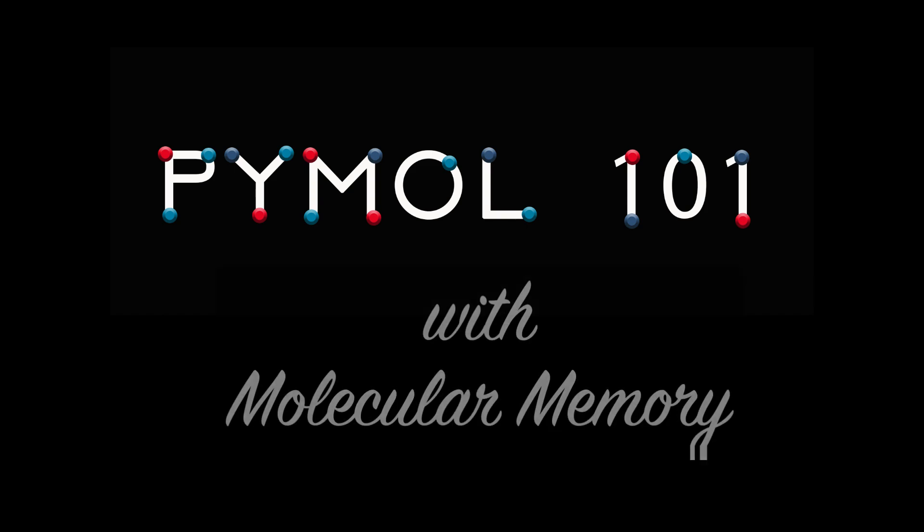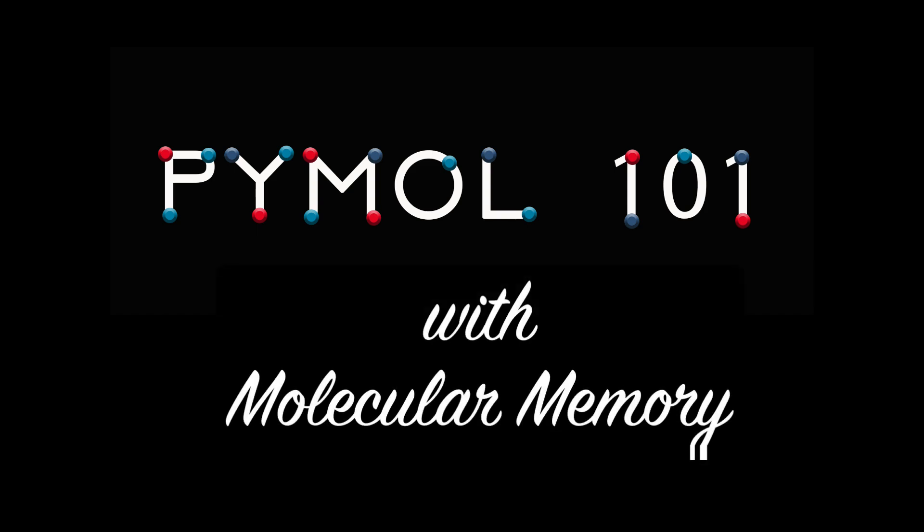Welcome to PyMol 101 with Molecular Memory. I'm KP and in this lesson, we'll learn about selection using the protein carbonic anhydrase.